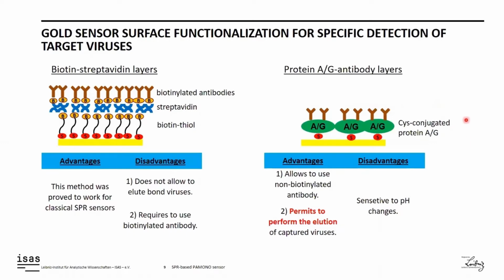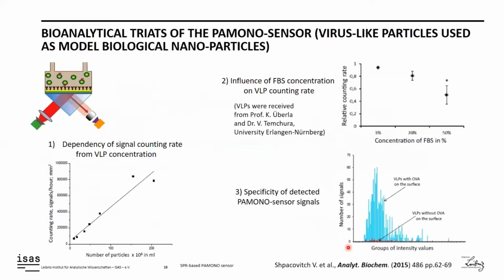The benefit of this method is the possibility of elution of already captured viruses or virus-like particles for further analysis by other methods. I also would like to mention shortly the bioanalytical features of the PAMONO-sensor.